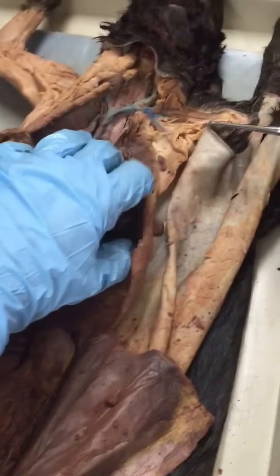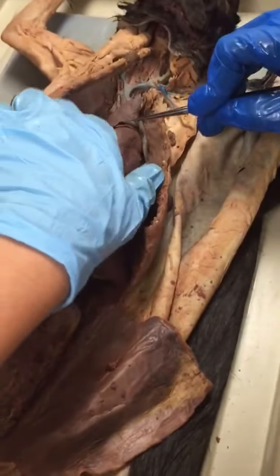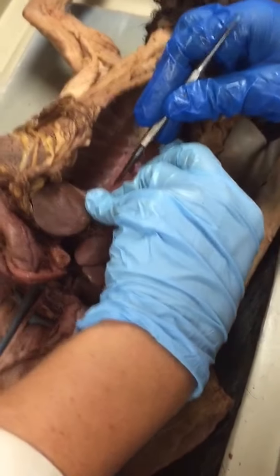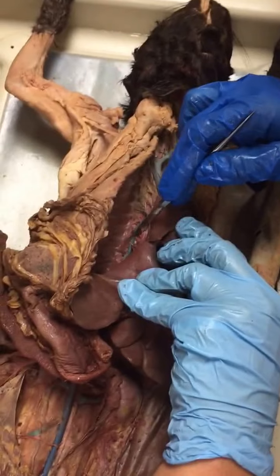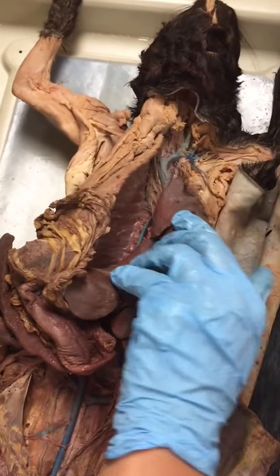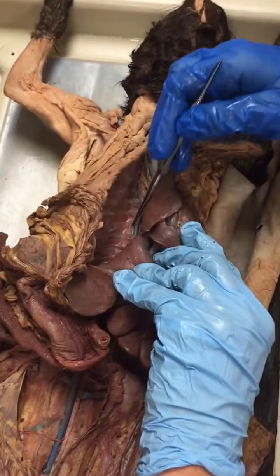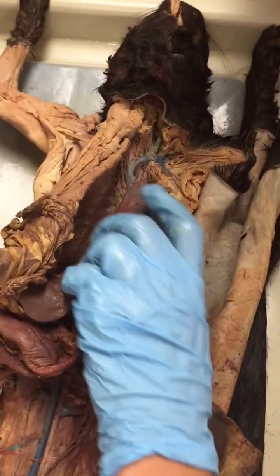For starters, on this side of the lungs here, we have our azygous vein, along with our intercostal arteries and veins going between each rib. Okay, so the azygous vein here on the back with the intercostal arteries and veins.